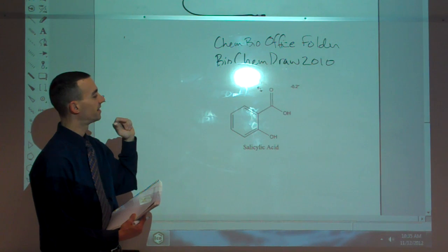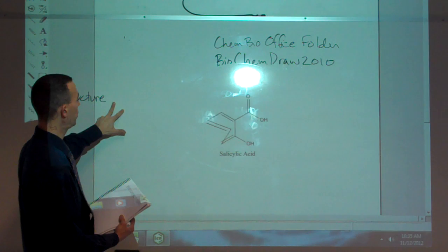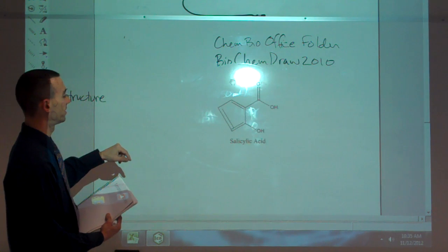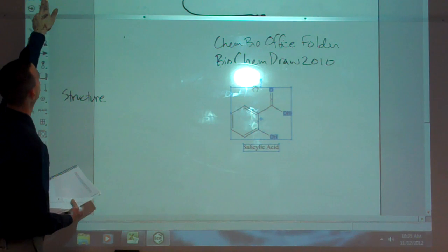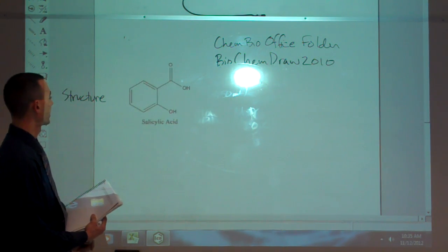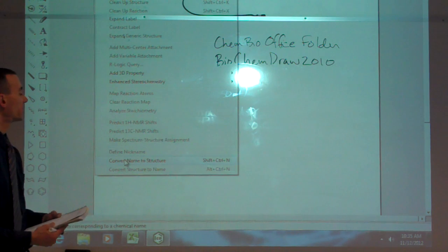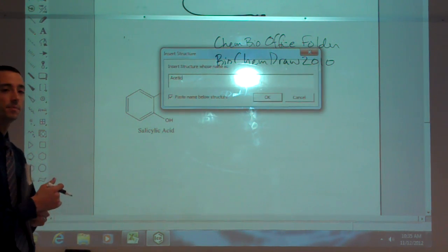All right? Okay. So let's take our salicylic acid and bring it over to the, whoa. Oh, you didn't have, yeah, just undo, I say Z, or there we go. Actually, another way to draw the box is a different way to grab things, and then you get everything that way. There we go. Okay. Now we can use our structure, convert name to structure again. And the other ingredient or reactant was acetic anhydride.